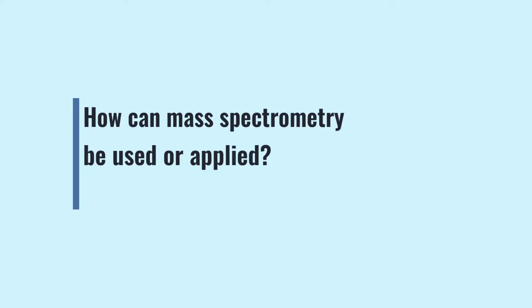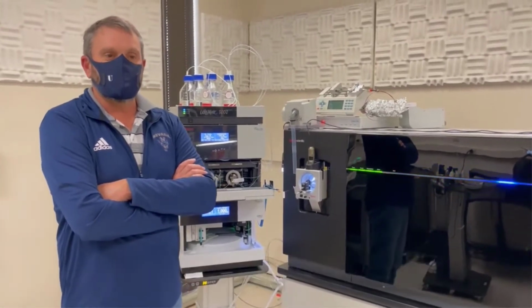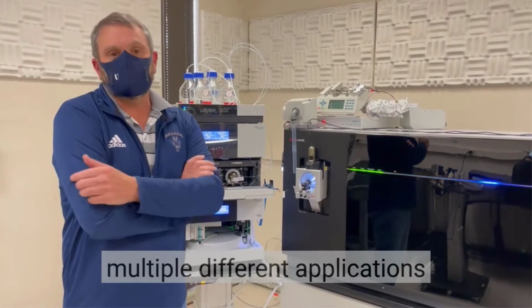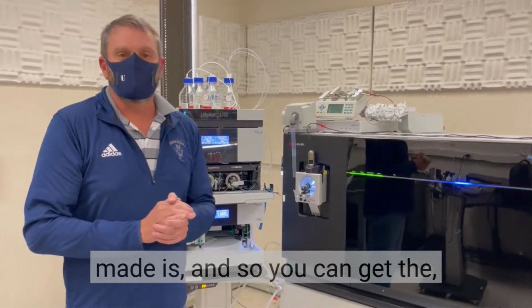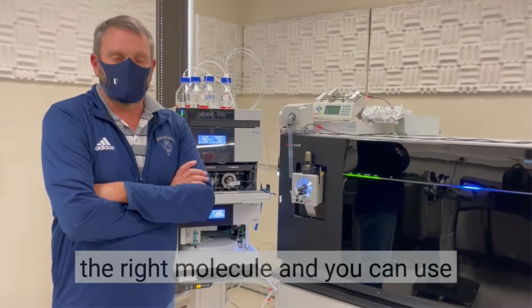How can mass spectrometry be used or applied? We use mass spec for proteomics, and mass spec can be used for multiple different applications. It can be used in chemistry, maybe synthetic chemistry, to know exactly what molecule they made, so you can make sure that you synthesize the right molecule.